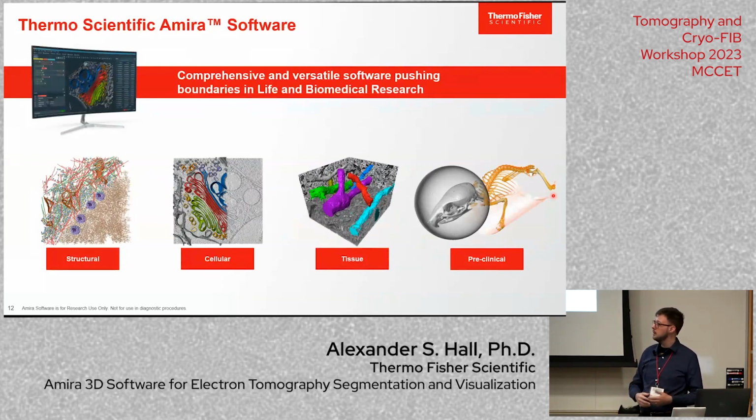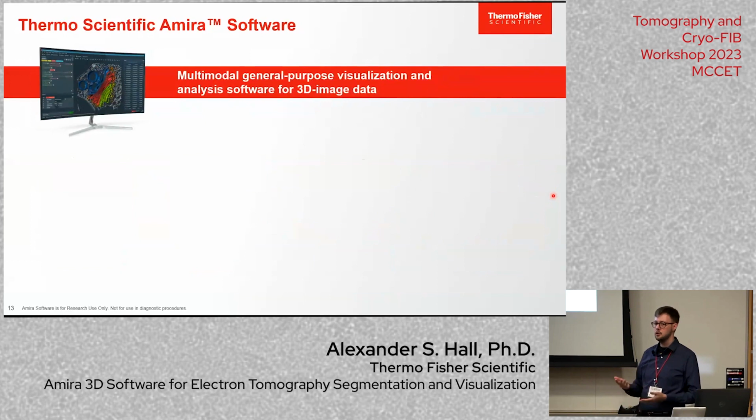So it's worth knowing that we can do molecular visualization in the software. If you have models from the Protein Data Bank, for instance, you can view those inside of Amira. There's a molecular visualization technology built into the software. We can also do what I call large volume analysis. That's the focused ion beam SEM, or if you use an ultramicrotome.